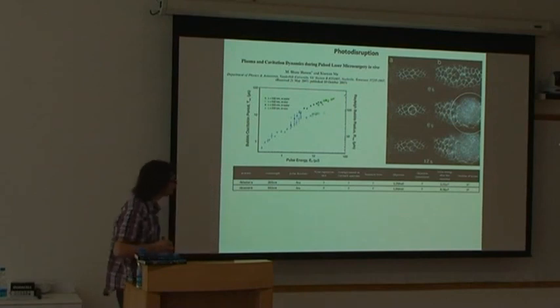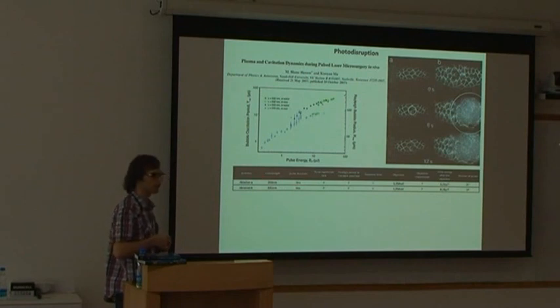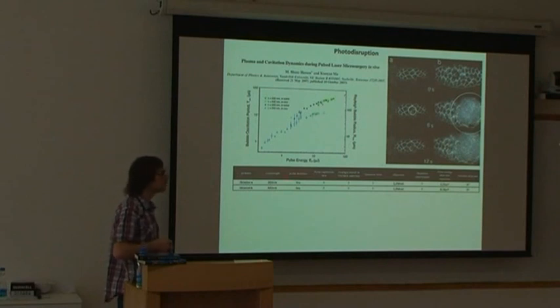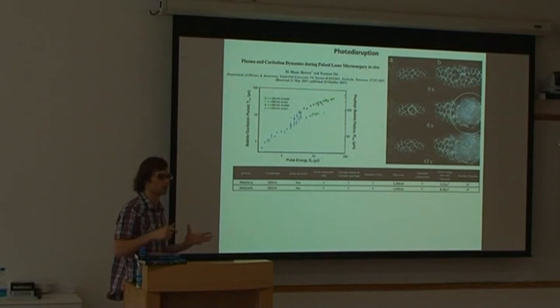So this confirms this experiment: normally when you have lasers, they have pulse duration around the nanosecond range, which means very wide pulses compared to the femtosecond or picosecond range. Normally the dissection, the laser ablation, is always accompanied with shock waves.